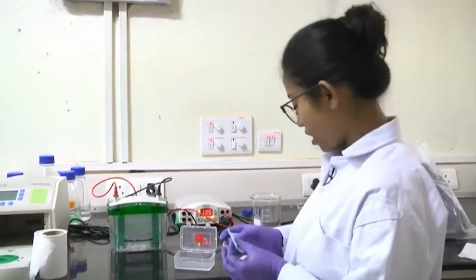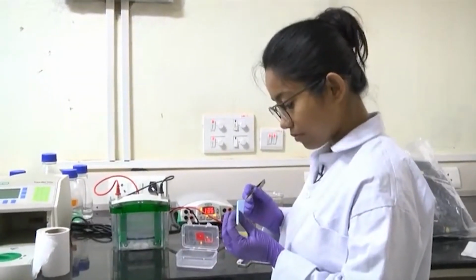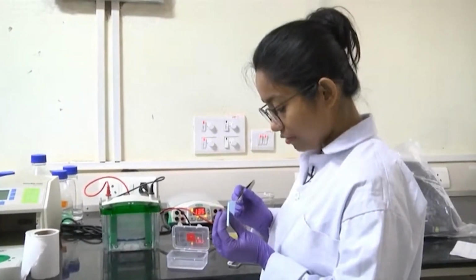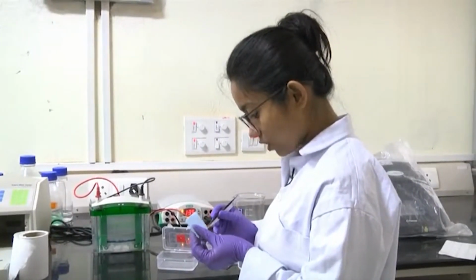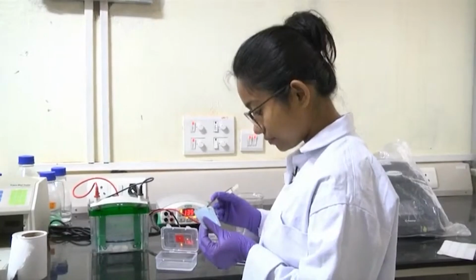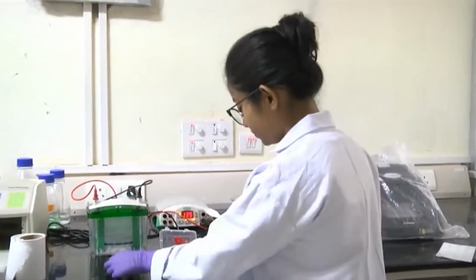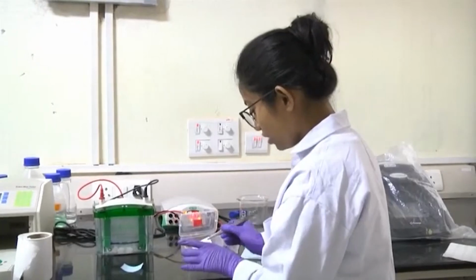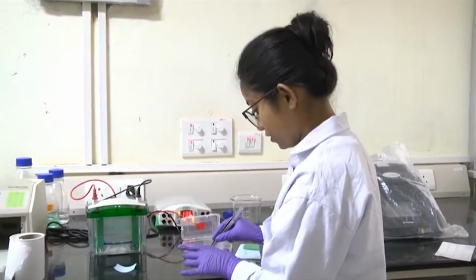Another important part of this technique is that you should not touch the membrane or the gel with bare hands. If you do that, then there will be some noise and you will get a blotchy blot. So using a forceps, I am taking out the membrane and I am putting this membrane in the transfer buffer.